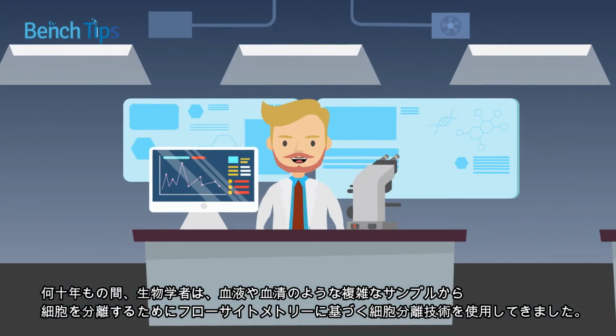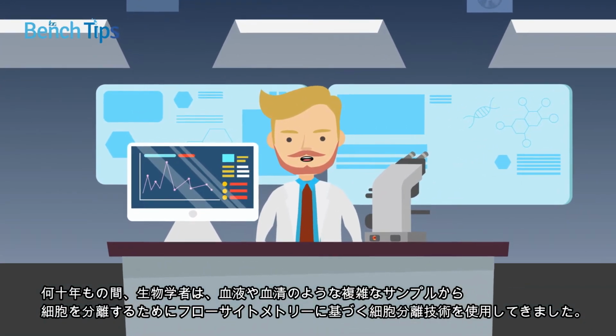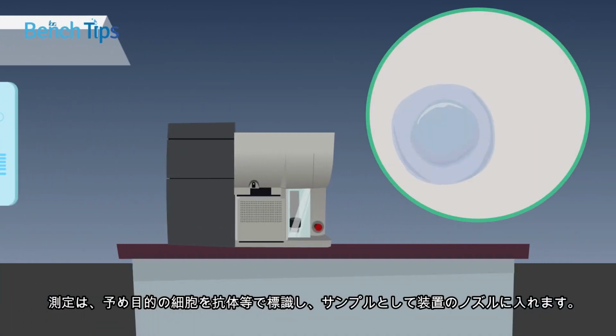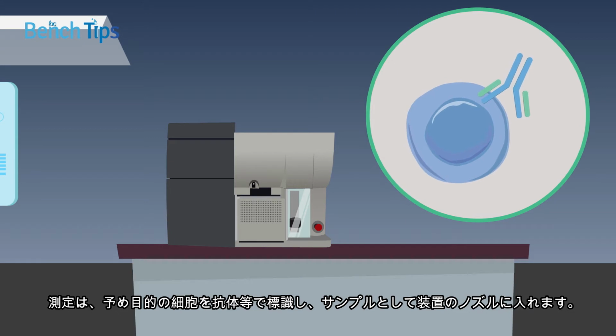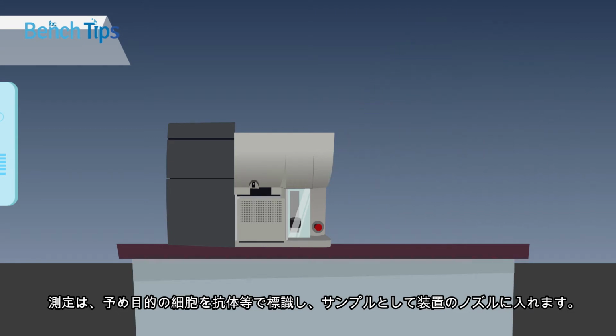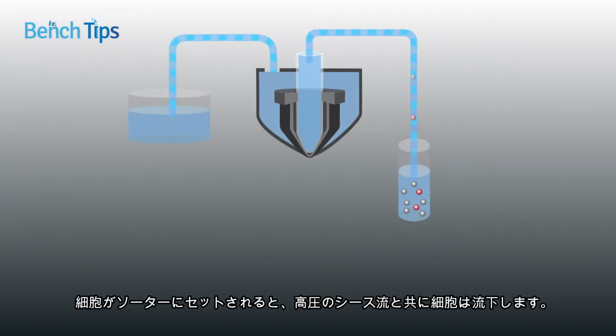For decades, biologists have used flow cytometry-based cell sorting to isolate cells from complex samples like blood or serum. This involves labeling the cells of interest with antibodies before introducing them, along with any unlabeled cells, into a cell sorter via a nozzle. As the cells enter the sorter, they are injected into a stream of sheath fluid that is forced through the system under high pressure.